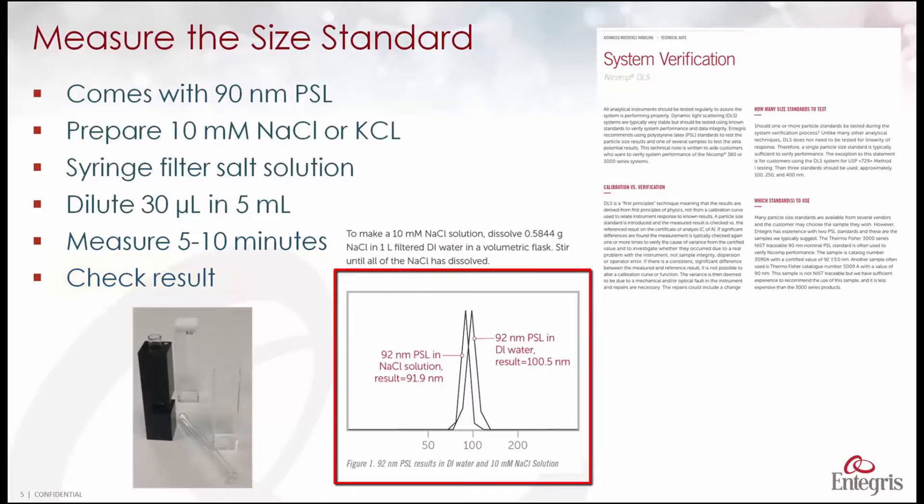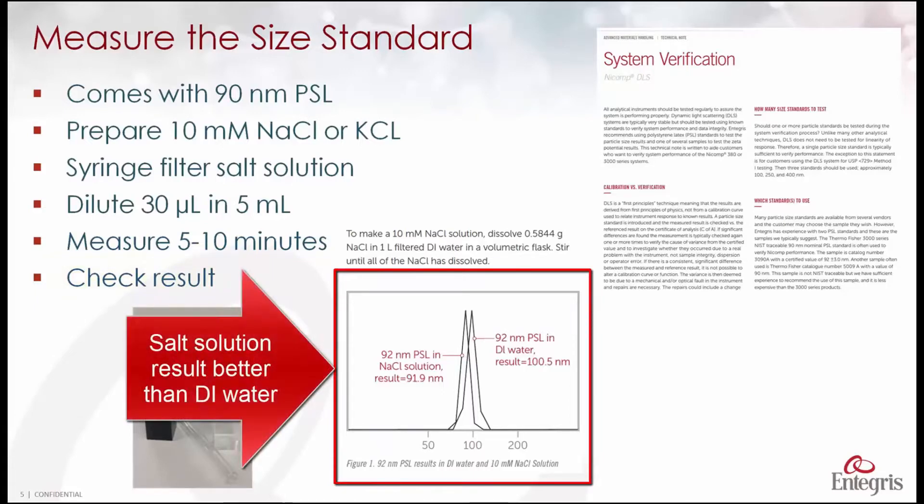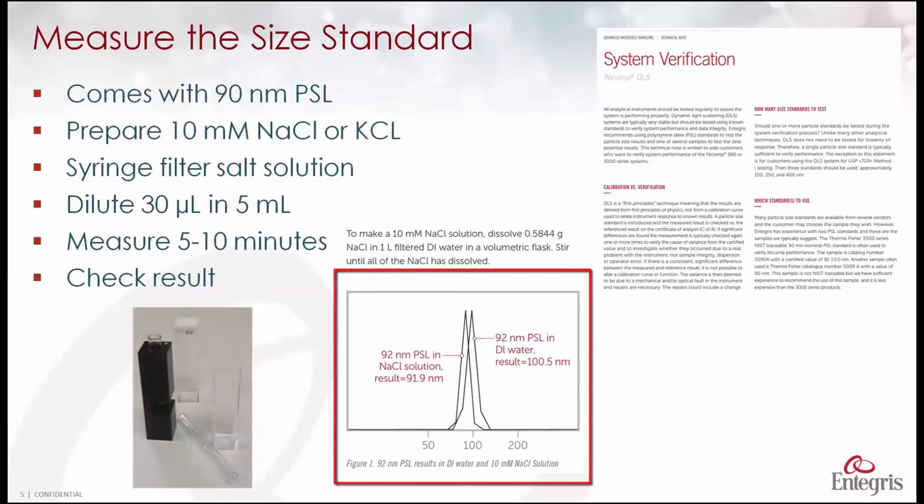The graph you see here shows the difference between measuring this sample in DI water as opposed to a salt solution. You'll see sometimes you can get away with it, but more often you're better off doing it in the salt solution.